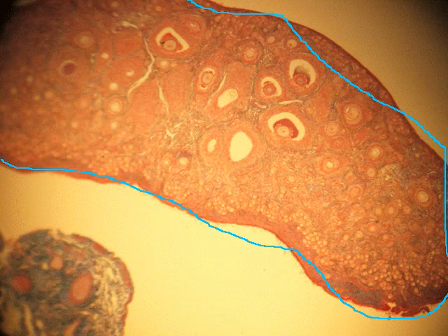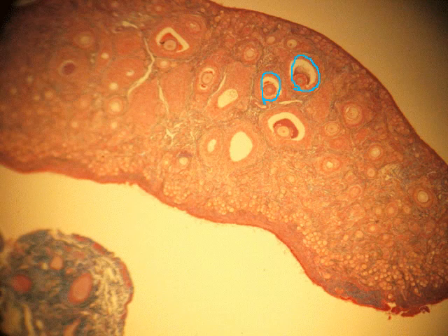Of course, that circle didn't draw just perfectly, but anyway, everything you see inside of there would be part of the ovary. And what you notice so much about it are these rounded areas. There you can see, here you can see, and then if you look towards the surface of the ovary, up in this cortex, you see the little tiny circles. Well, what these are follicles in various stages of development. I believe this particular slide is a mouse ovary, so mice produce a whole lot more offspring each time, so you're going to have a lot more follicles developing.